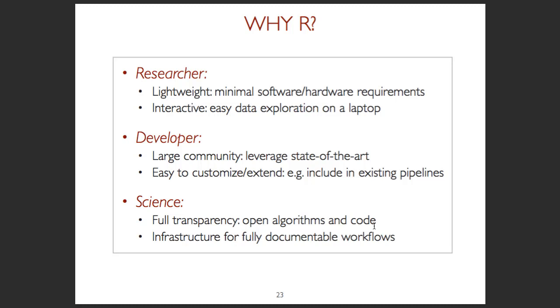So there are many good reasons from different perspectives. From the researcher perspective, meaning the mass spectrometry researcher, it is a lightweight environment. You don't need to work very hard to install the software. It is very interactive. You can explore the data. You can get quite far with a fairly small amount of coding skills.